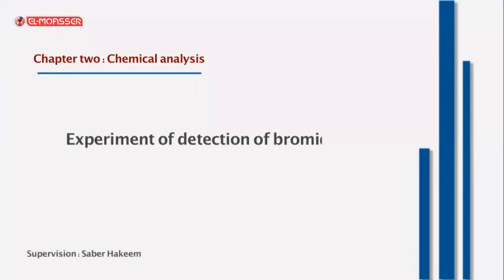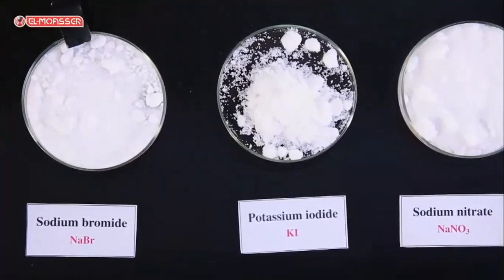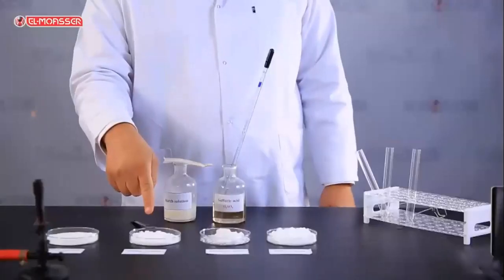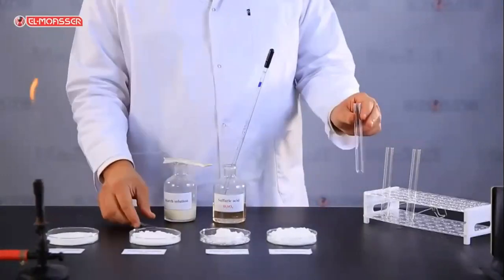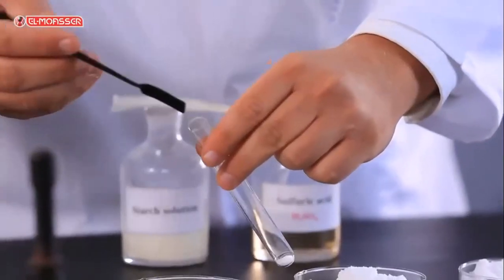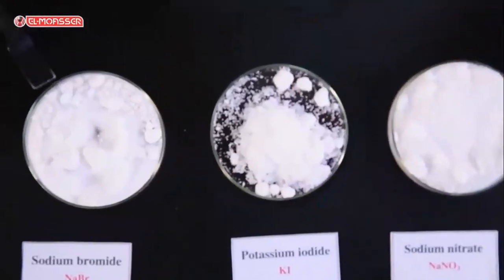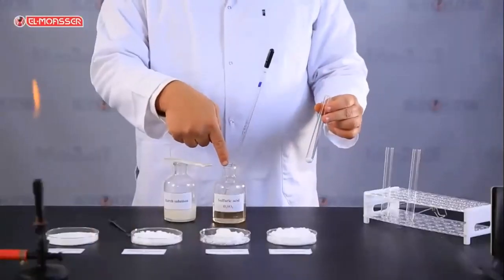Experiment of detection of bromide anion. Bromide anion is detected in sodium bromide salt by a main experiment and another confirmatory experiment. Main experiment. Add to sodium bromide salt drops of the group reagent, which is the concentrated sulfuric acid.